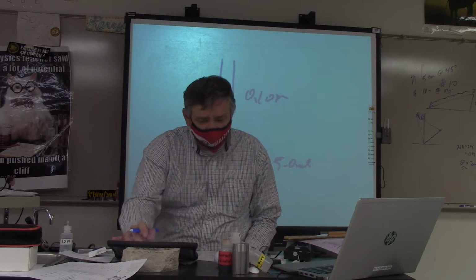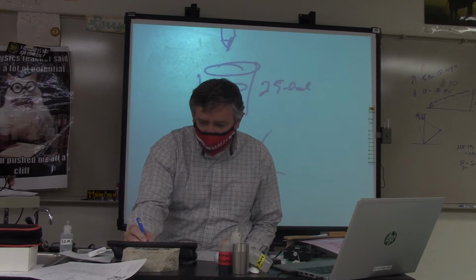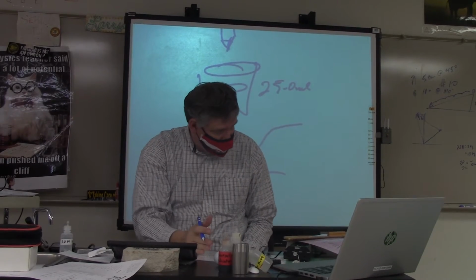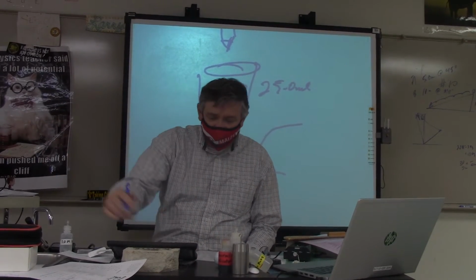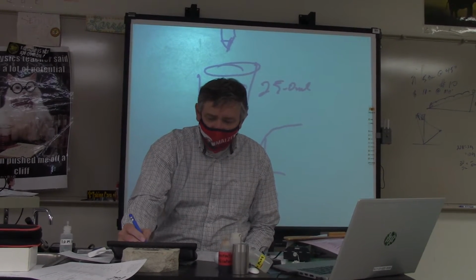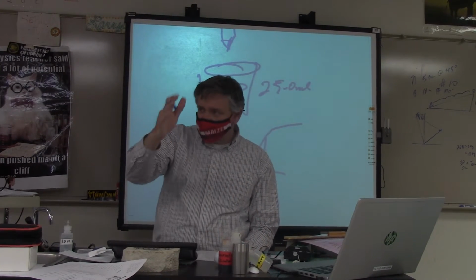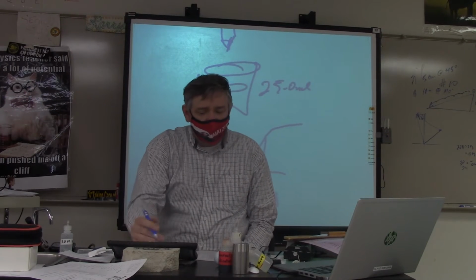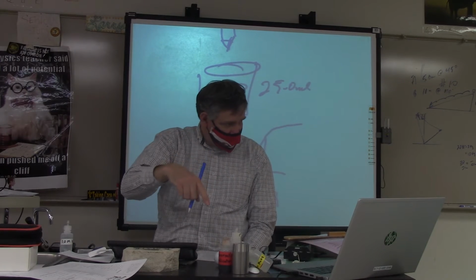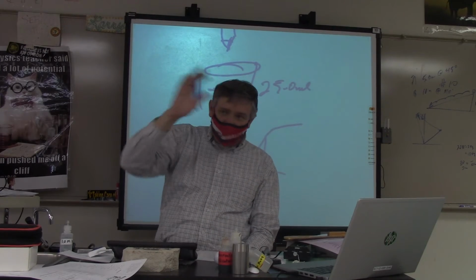Now, even though I'm not asking you to actually do this, on that first curve, what you should be able to do, if you just have the data from that first curve, is realize, oh, here's the equivalence point, okay? And from that, you could calculate the molarity of your acid if you wanted to, because you could use MAVA equals MBVB. You should be able to realize, oh, I can go to half the equivalence point when it's half neutralized and get an experimental value of my pKa. So that's what we did on that first lab.